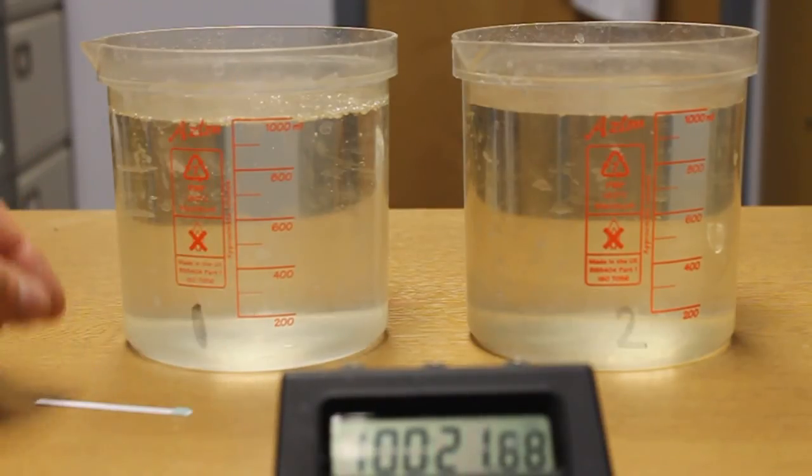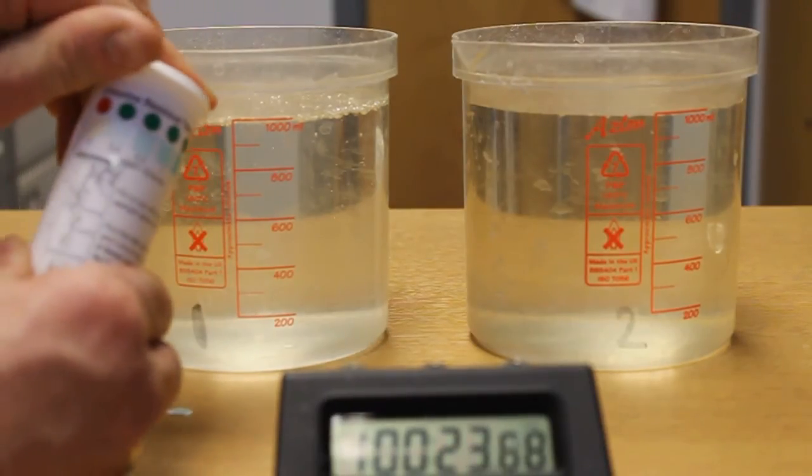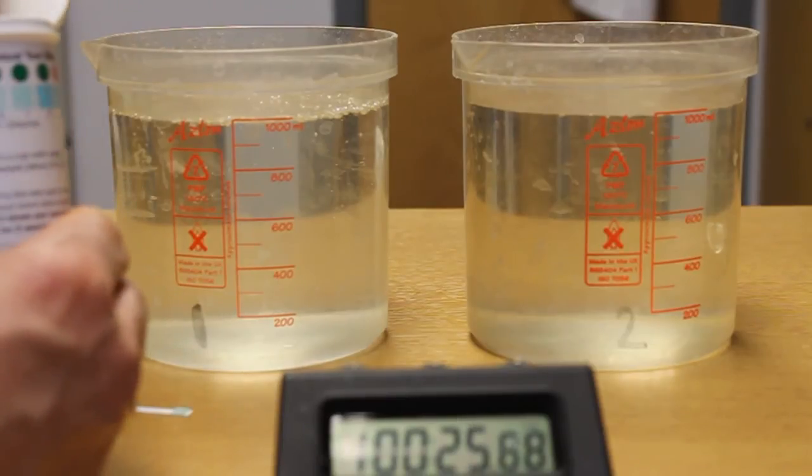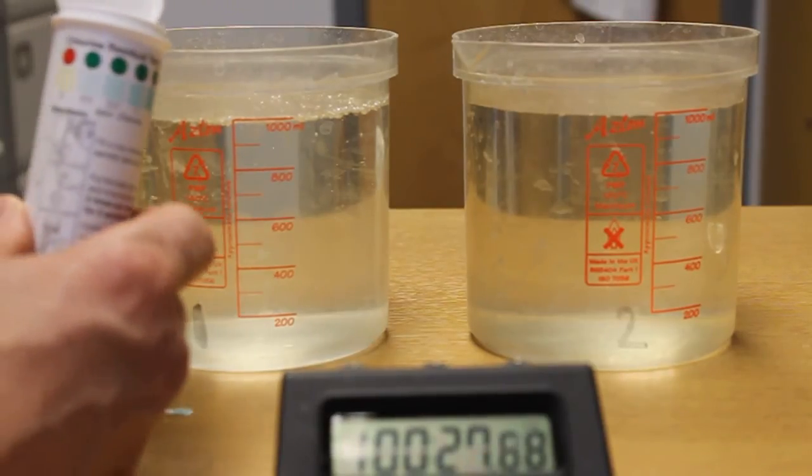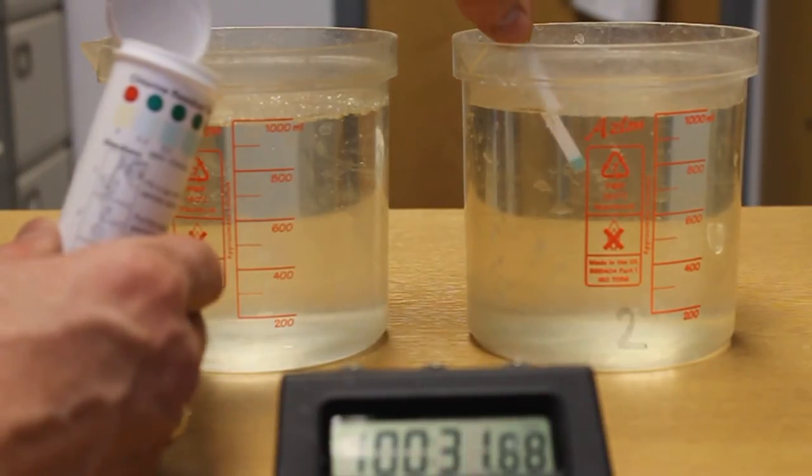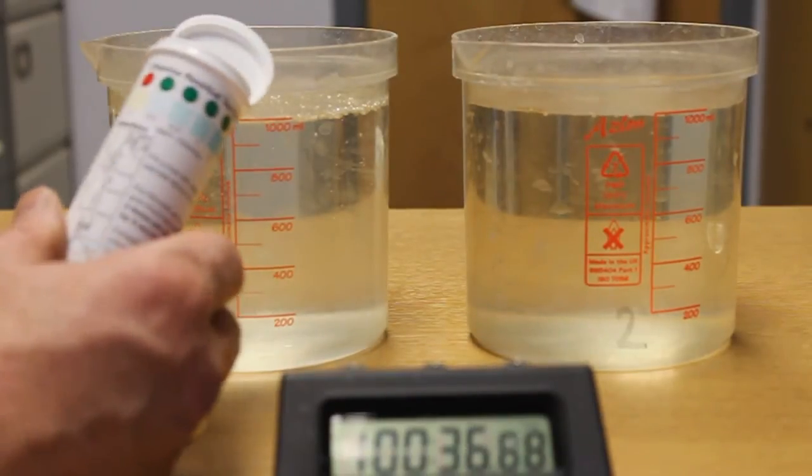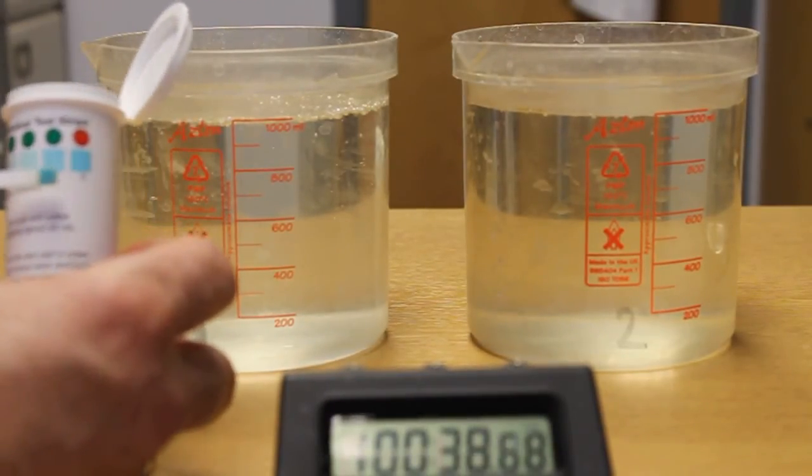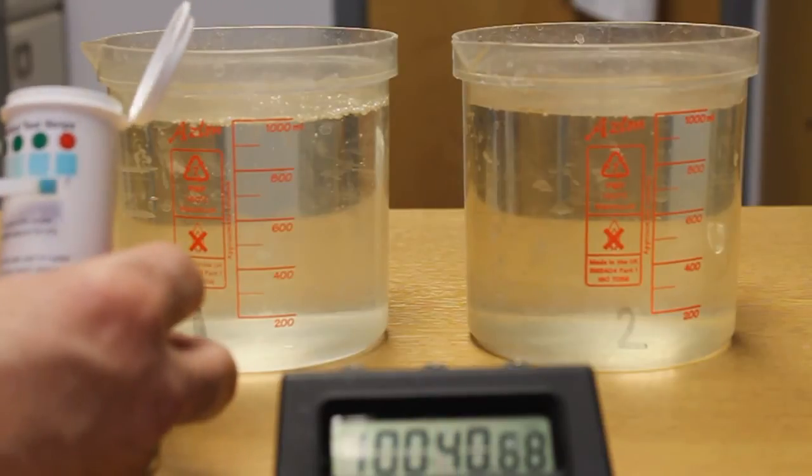Now we will test the one with two tablets, much the same way. Take out the strip, put it in the water. 1 second, 2 second, 3 second, 4 second, 5 second. And we can check it against the water. As you can see it is much stronger colour coming up to around between 2 and 5.